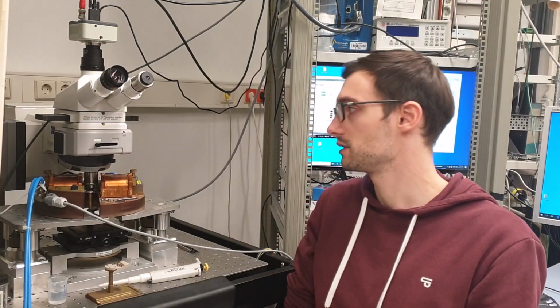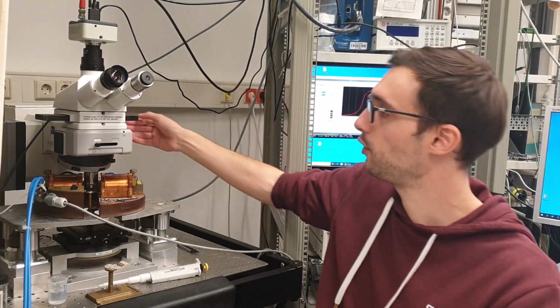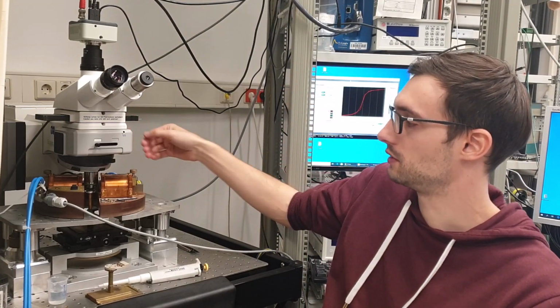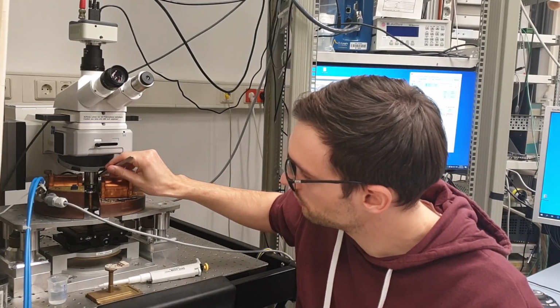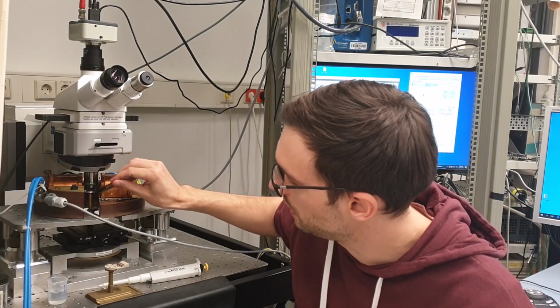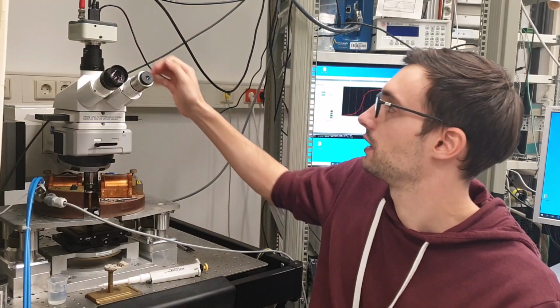So the basic parts are a light source, which is here, a polarizer, which sits here to give linear polarized light, an objective here to focus on the sample surface, which lies on the sample holder here, and a camera to visualize the magnetic microstructure.